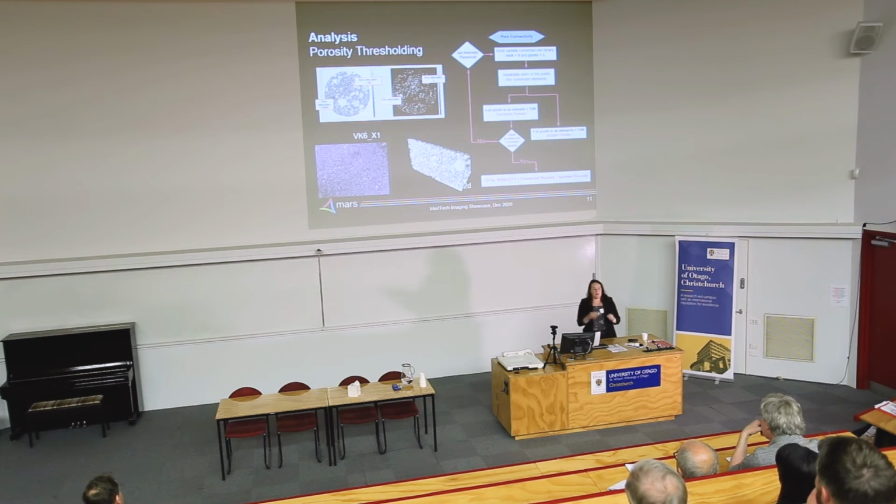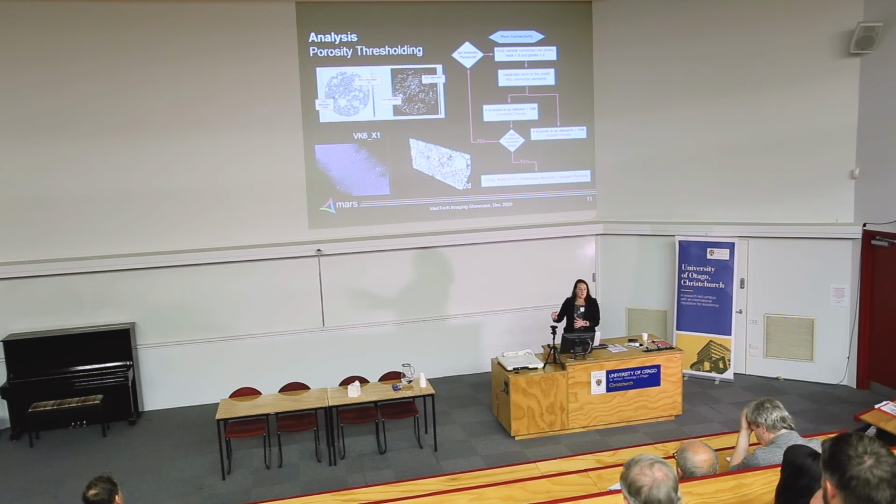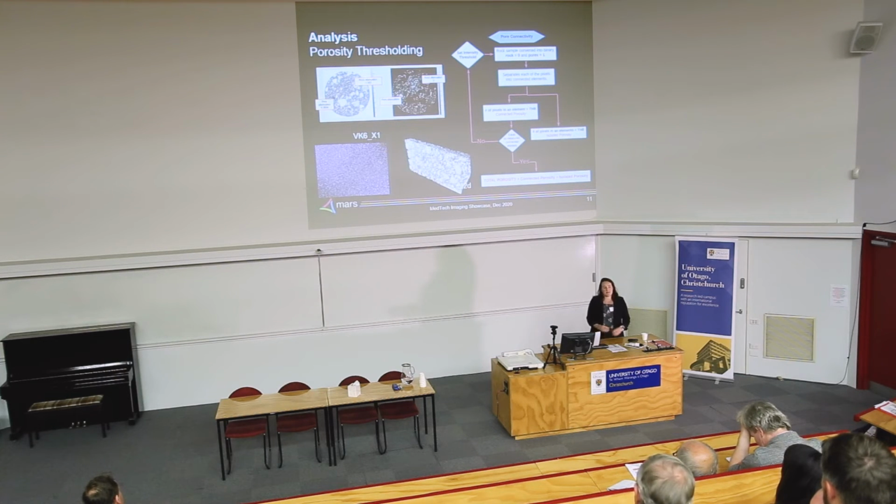Another very basic function determines all of the connected elements within these thresholded pores, and from here we split this into connected porosity and isolated porosity. From here we were able to take the data that was given from geologists of the connected porosity found from the helium pycnometer and compare it exactly. So we'd get the connected porosity, compare it, and then from there we'd be able to find out how much of the rock was isolated and hasn't been picked up, and what then is the total porosity. If it didn't match, we'd then reiterate, set another threshold until we managed to get it within a percentage.